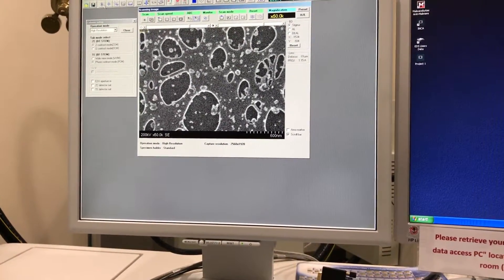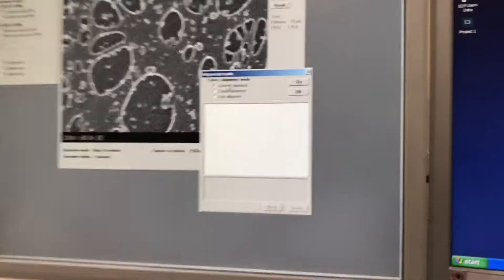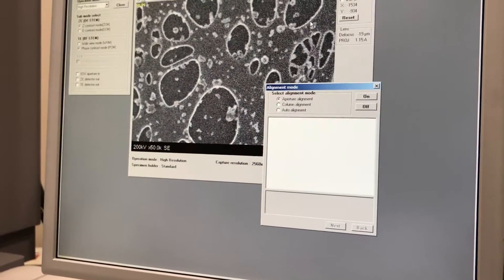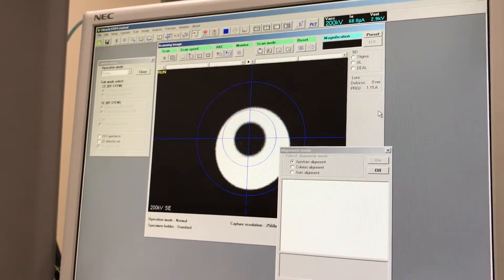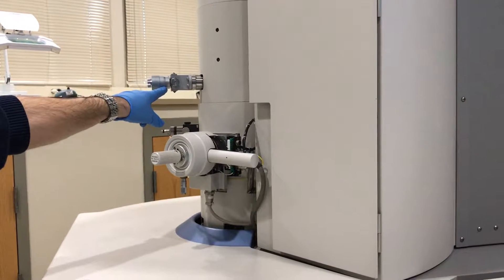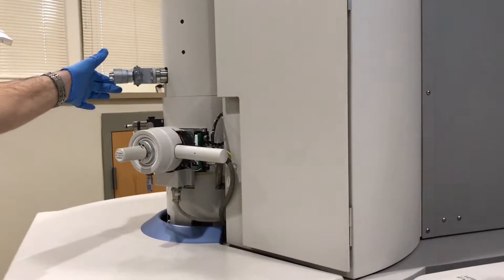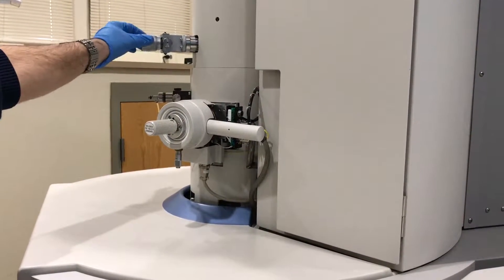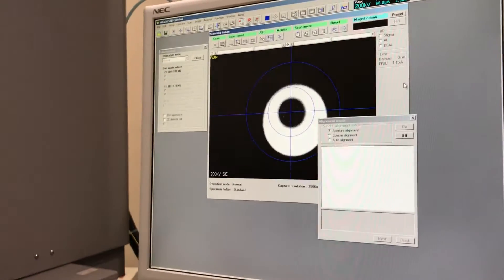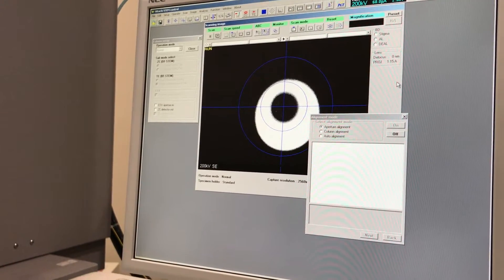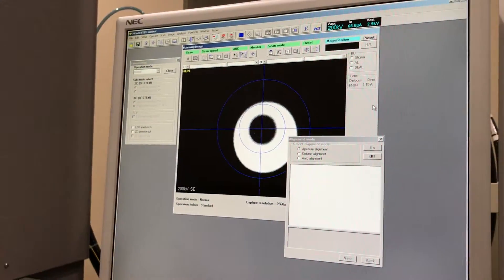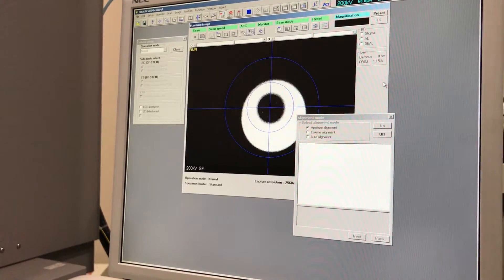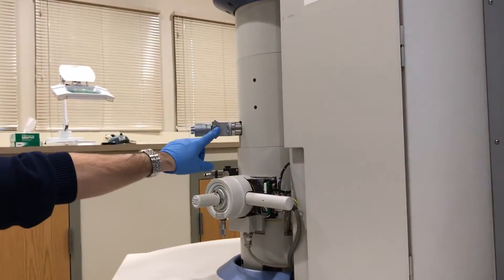So let's start from the second step, which is aperture alignment. Aperture alignment makes sure the beam is passing through exactly the center of the column. Turn it on — it looks like this depending on what aperture you use. You can change your aperture here to number one, two, three, or four. Usually number two is good for imaging, and number four is for reducing the size of your beam — if you are doing nano diff or lattice imaging, number four may be better. Usually we start with number two. As you can see, the aperture is not exactly on center, so by rotating these two knobs on the aperture, I can bring it to the center.